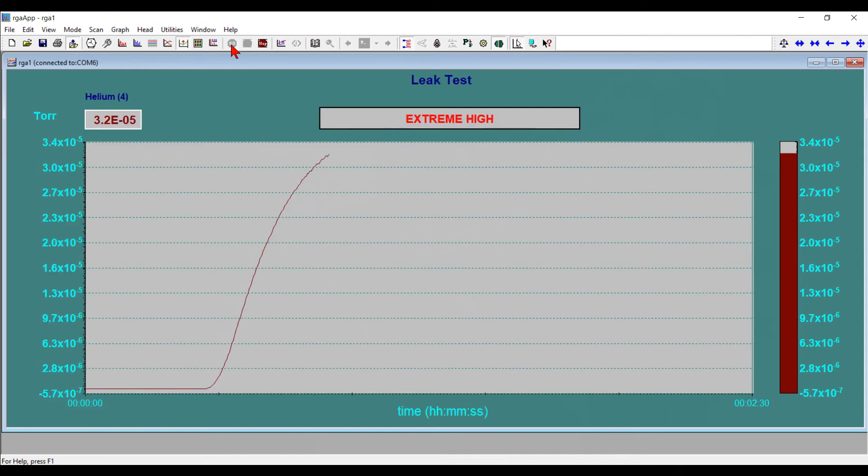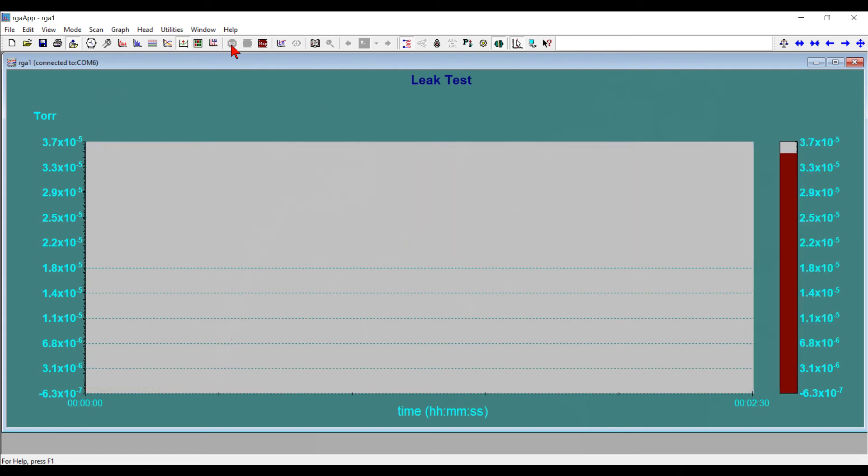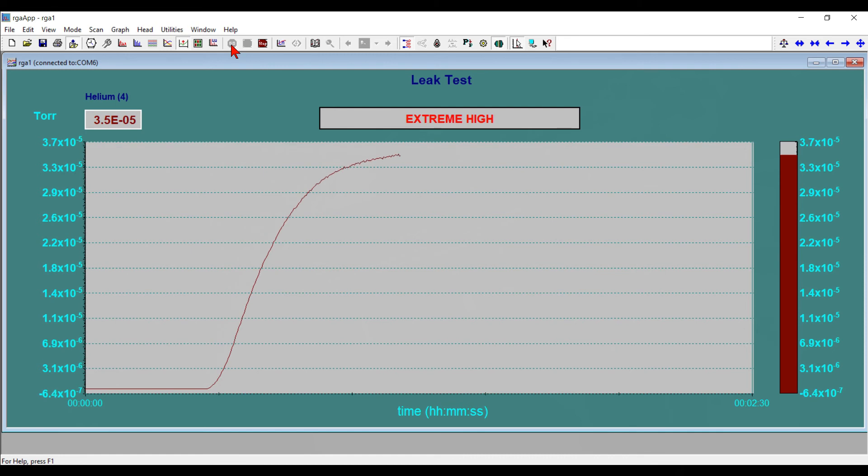We can see that the slope is starting to level off — I'm not putting helium in anymore, I've pulled it away. So since we know that the leak is on the inlet of that Baizer's leak valve, it's quite likely that the set screw just needs to be adjusted on the leak valve.